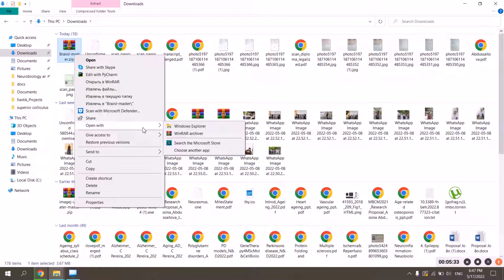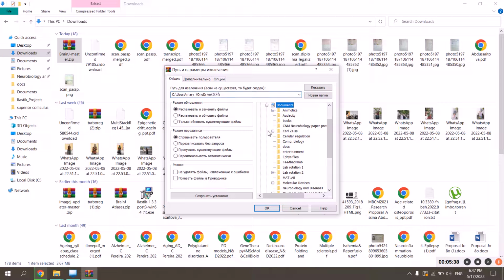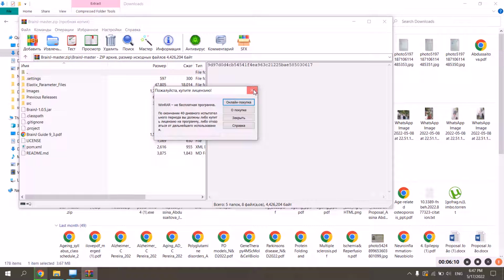Okay, so basically we just need to unzip them somewhere nearby, in the same folder you used to install your Fiji, and I installed it right here. You should open Fiji, then go to plugins, and here you will install all the plugins. If you open it, it's going to be a lot of files.